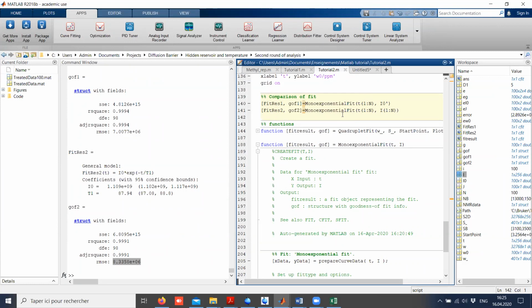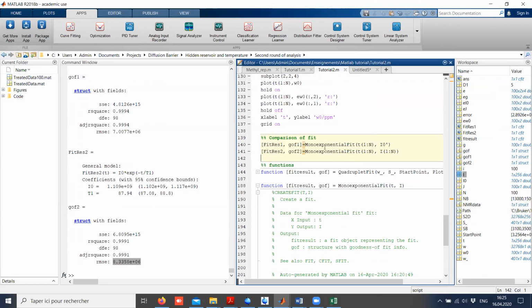Also, I have taken a simple example where it's not crucial, but this sort of deconvolution can be really interesting if you have two Lorentzians which overlap and you want to fit the T1 separately. If you just integrate by summing the numerical values, you cannot deconvolute them. Or you can do it by exponential fit, but it is not as precise. So this Lorentzian deconvolution is really powerful.